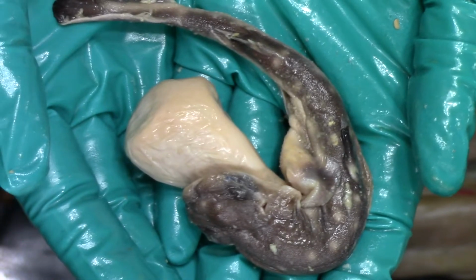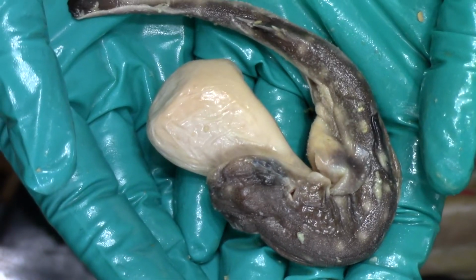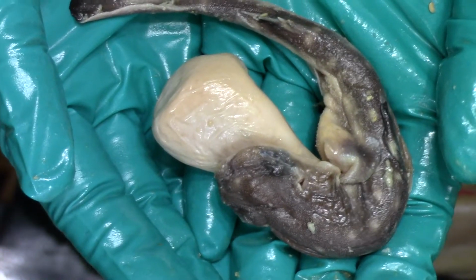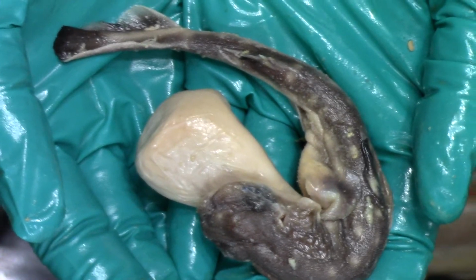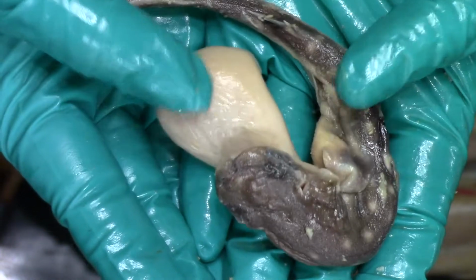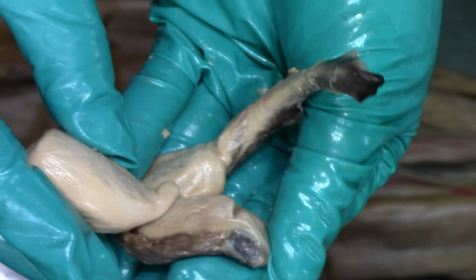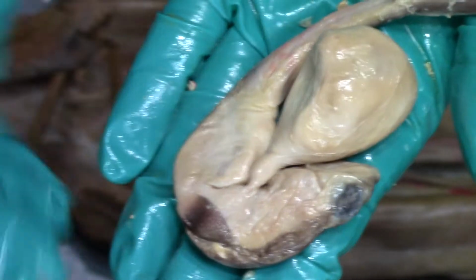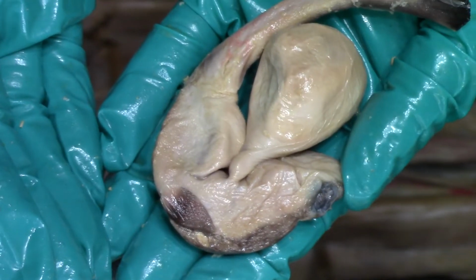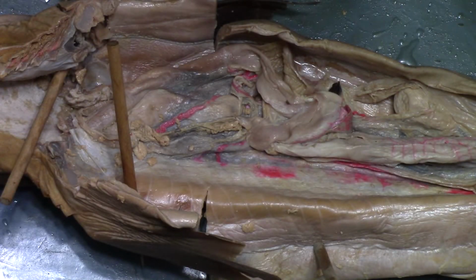So this is what's cool about sharks, is even though they lay eggs, some of them are viviparous, where the baby sharks develop inside the mom and then are birthed fully formed. Instead, some sharks lay an egg, and they call them mermaid's purses. You get these weird eggs outside of the shark, and the baby develops outside of the mom. But in a lot of species of shark, the baby develops inside the mom. Look at that little pectoral fin. So this is a species of shark that is viviparous. Put it with the rest of the eggs over here.